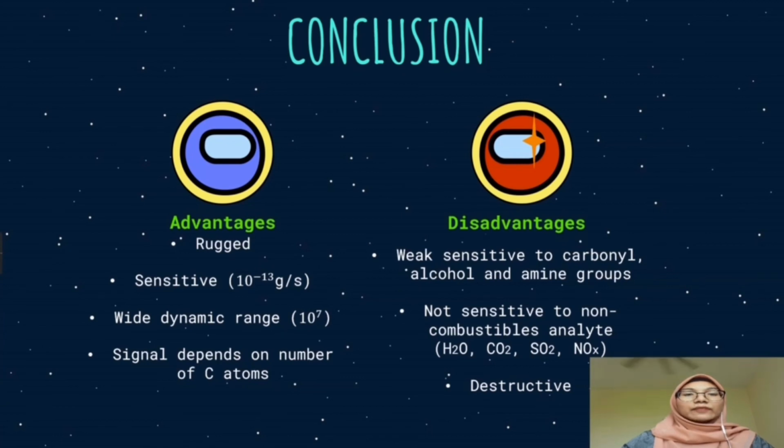The disadvantages are that it is weakly sensitive to carbonyl, alcohol, and amine groups. It is also not sensitive to non-combustible analytes such as H2O, CO2, SO2, and NOx, and this detector is a destructive method.